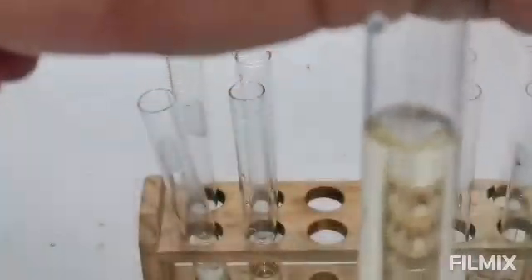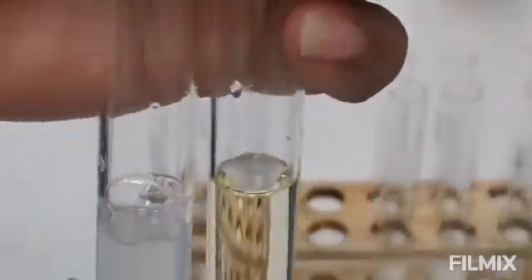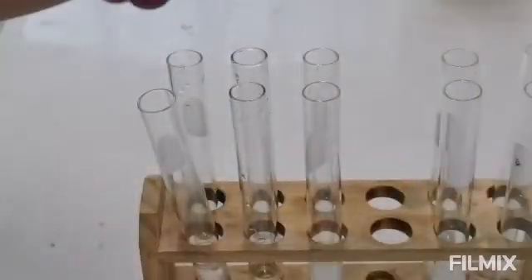Okay, this is your beef extract. This is your egg albumin after adding citric acid. This is your beef extract.